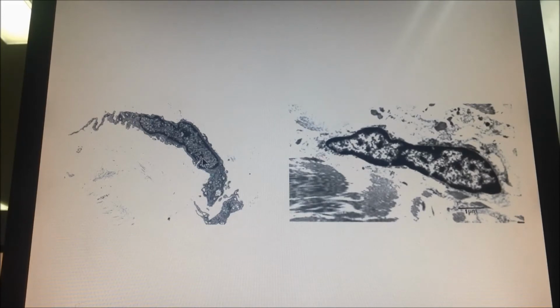On the left at first, more clear. How to identify the fibroblast? Well, multiple characteristics. Number one, the shape of the cell is tapering or spindle shape. مغزلية الشكل. Number two, the nucleus is irregular, pale. بيقول كروماتين شوي فاتح, pale.